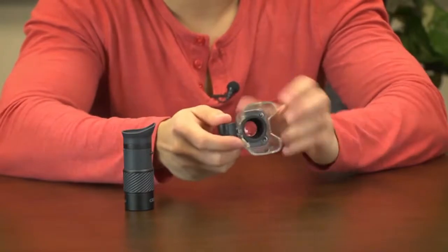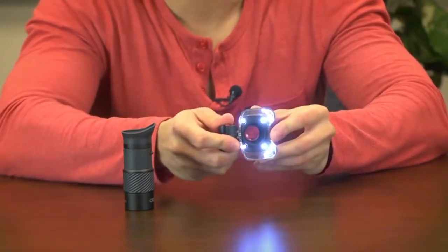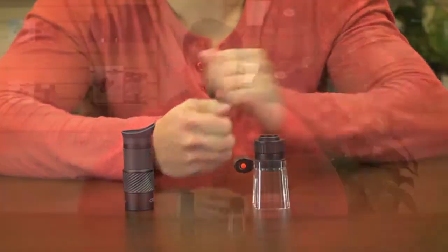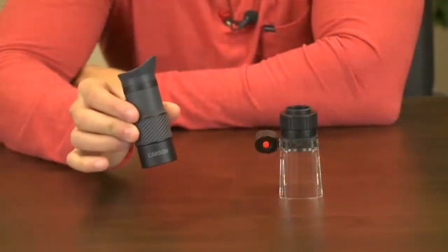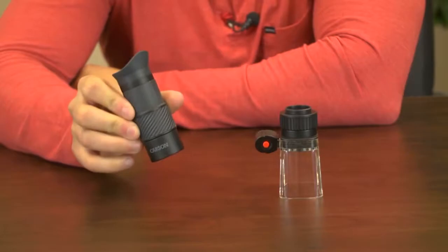All three of these are focusable and check this out, there's four super bright LEDs built right into the see-through base. So let's start with the monocular. If you're like me you love the outdoors and usually looking to carry with you as little as possible, but this monocular is something I always bring with me simply because it's very lightweight and the optics are great.